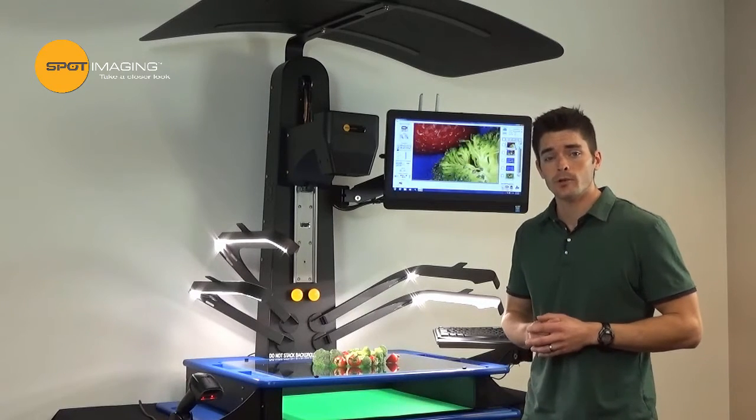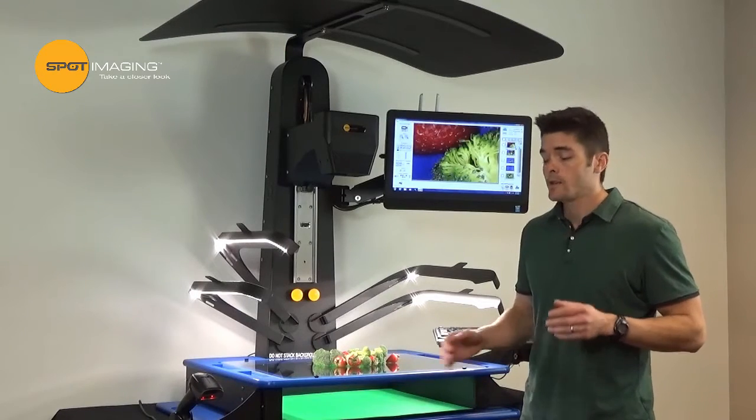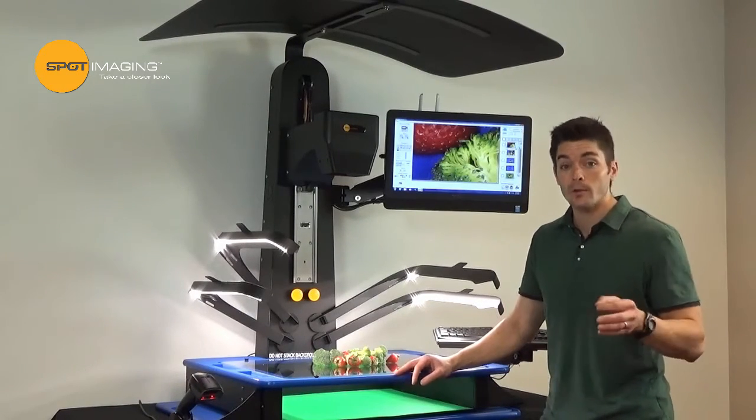Hello, I'm John Tarangio with Spot Imaging and today we're going to take a closer look at our fourth generation pass stand. This pass stand is designed specifically to capture publication quality images while optimizing your workflow.